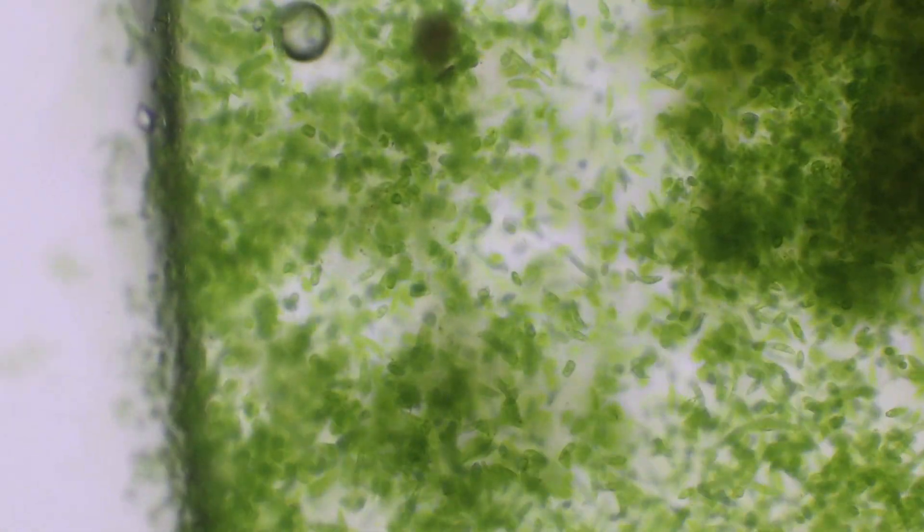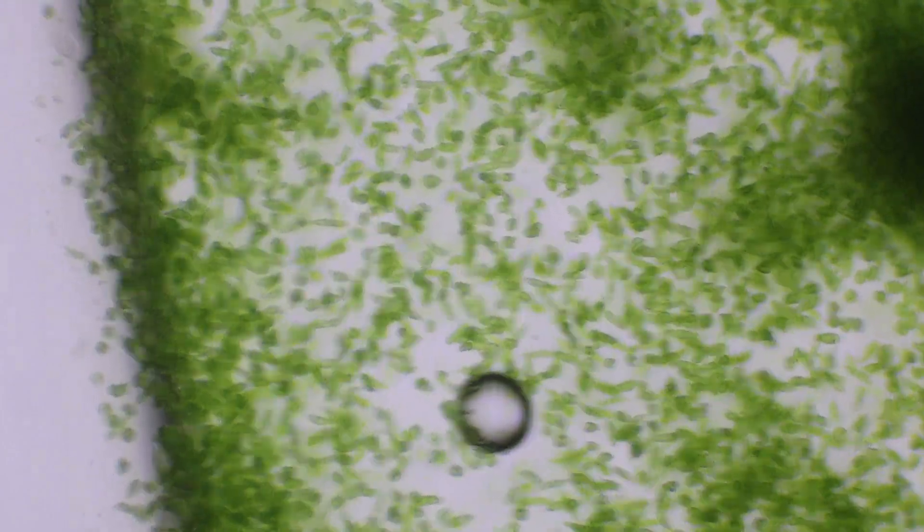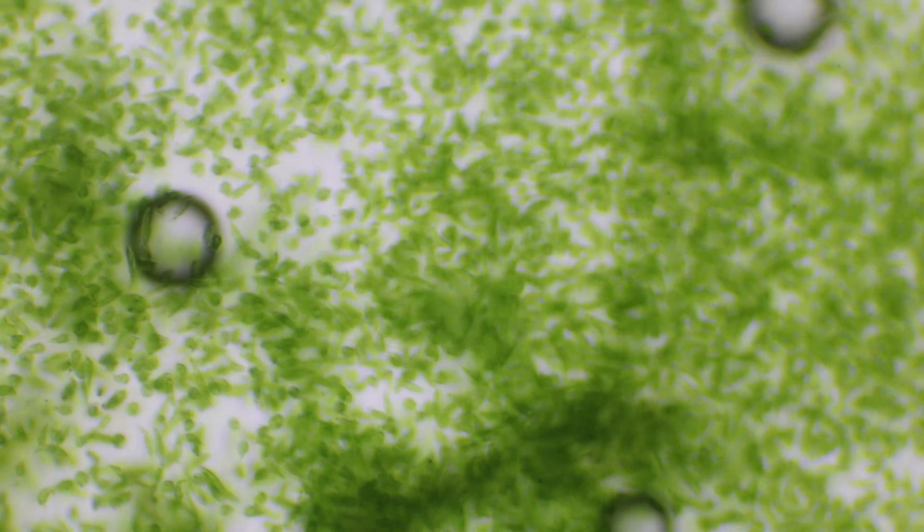If you look closely, you can see each one's individual eye spot. And they congregate near these sides because that's where the most dissolved oxygen is.